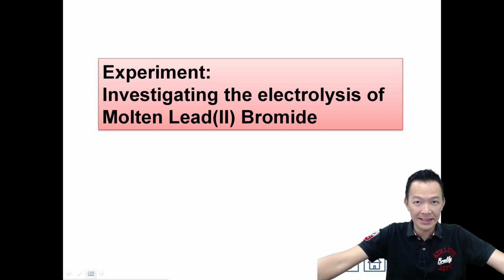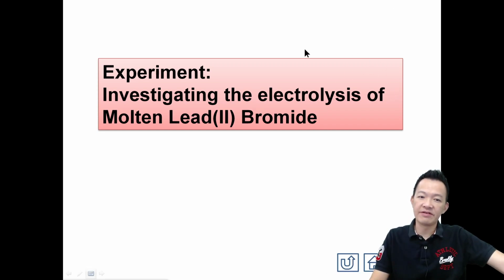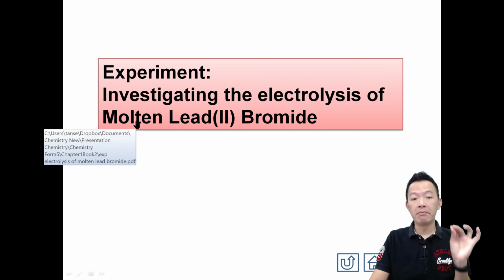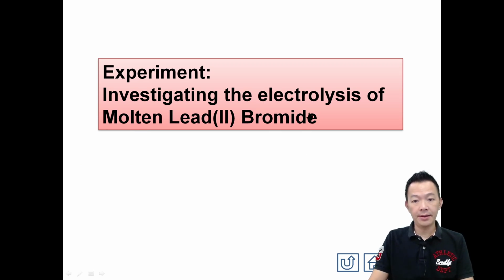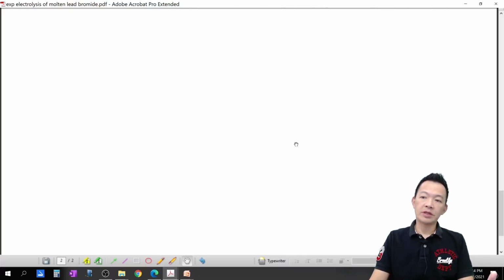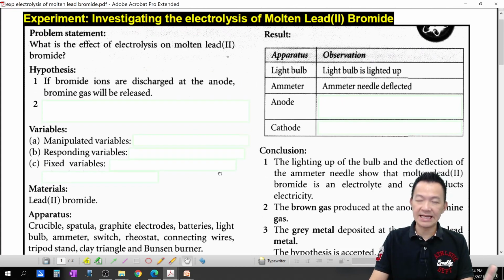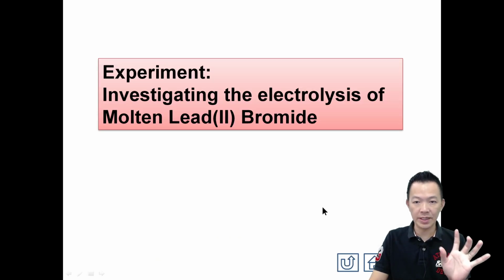Welcome back. Now we continue to prepare experiments, and we want to study the electrolysis of molten lead bromide. 非常出名的实验 OK? Lead bromide 去做电解法 but molten lead bromide only OK? Before we talk about our experiments, before we fill in the blank for our experiments, let's look at the experiment. 看看它的实验线 OK? So what's going to happen?